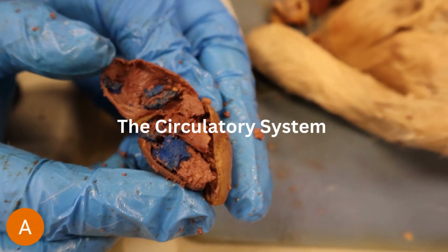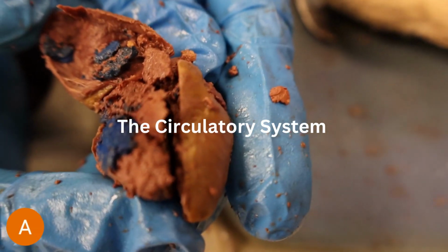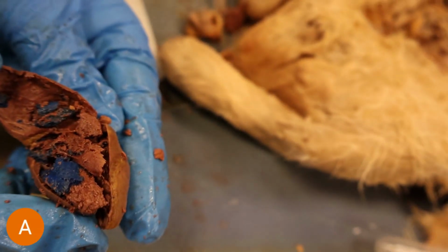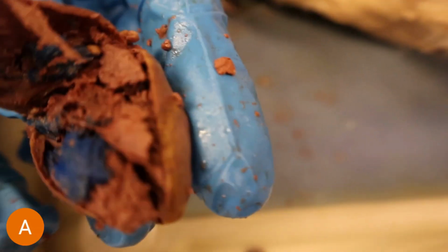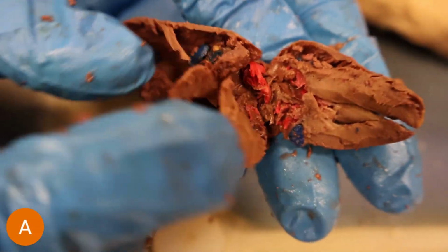Okay, so this is the circulatory system of a rabbit. The circulatory system consists of the heart along with its chambers. We cut it out of the rabbit and cut it open to show you all the different arteries and ventricles that are inside, along with the different blood vessels and veins that are dyed blue and red. In the clip before this, we discussed the respiratory system.